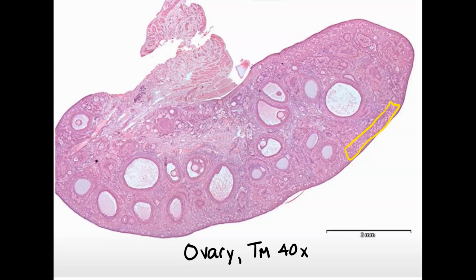Those primordial follicles will get called up and eventually they will mature under the influence of estrogen to become these Graafian follicles. And the Graafian follicle is where you have an ovum ready for ovulation. So we're not going to ask you to make a distinction between the term ovum and oocyte. The basic difference is that the two terms refer to different stages of development.